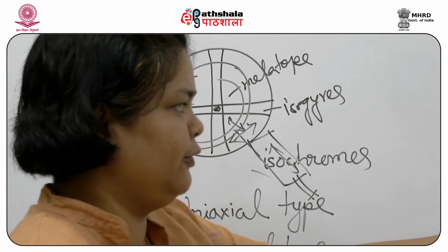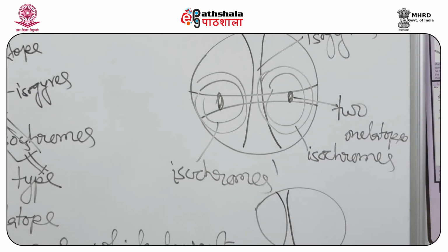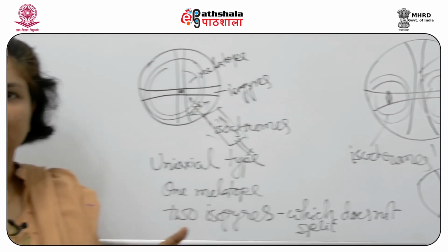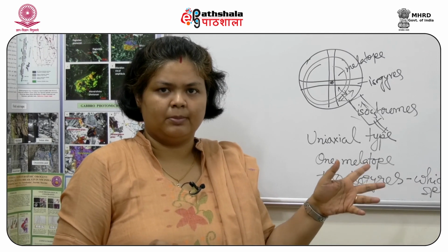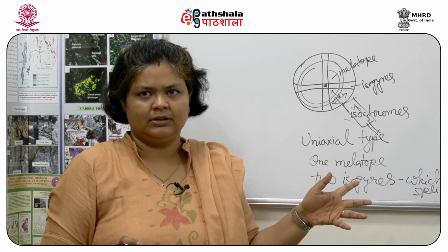Similar is the case for this addition or subtraction of the birefringence, or the retardation as we call it, which will help us find out the optic sign of the mineral we are observing for the biaxial condition. So with this I conclude this class.